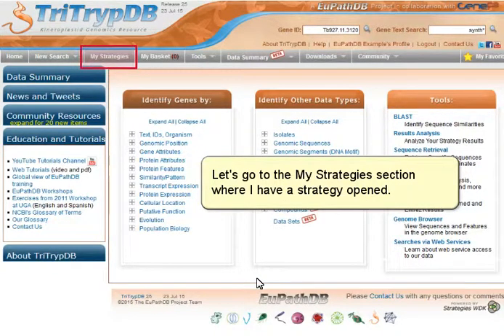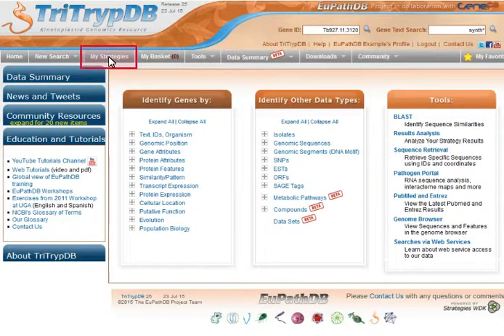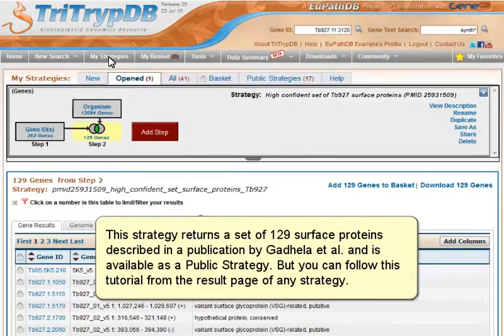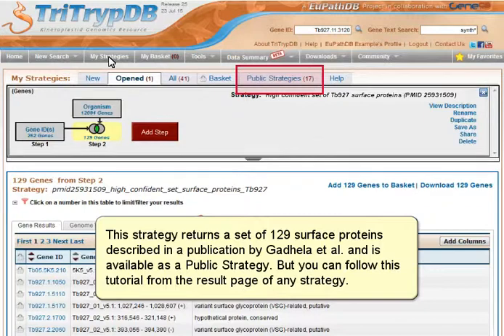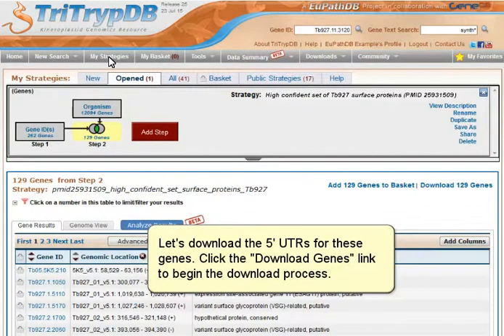Let's go to the My Strategy section where I have a strategy opened. This strategy returns a set of 129 surface proteins described in a publication by Gedela et al. and is available as a public strategy, but you can follow this tutorial from the results page of any strategy. Let's download the 5' UTRs for these genes.